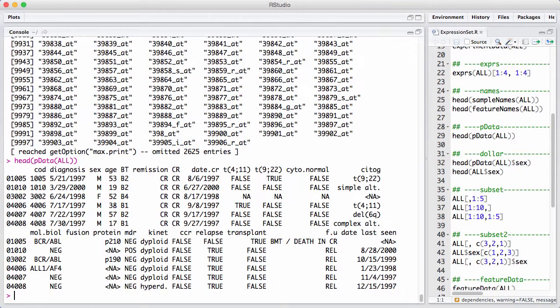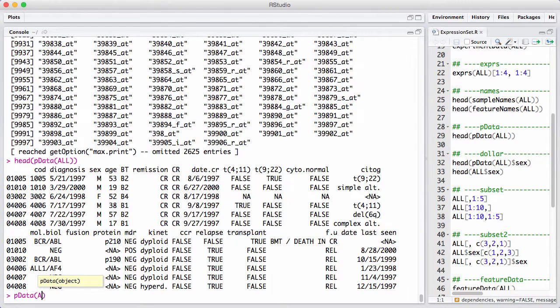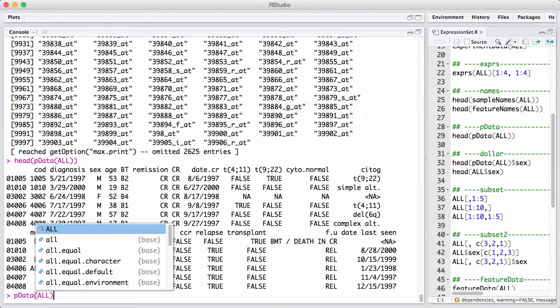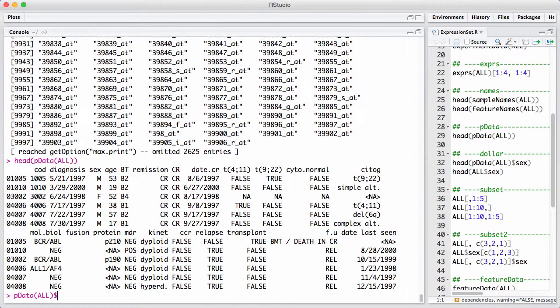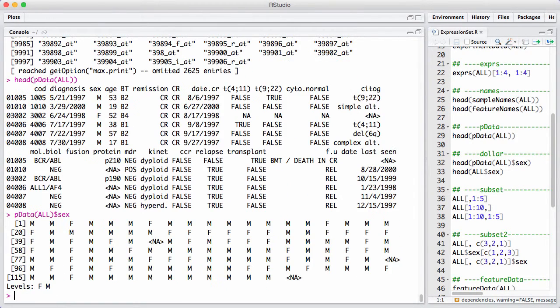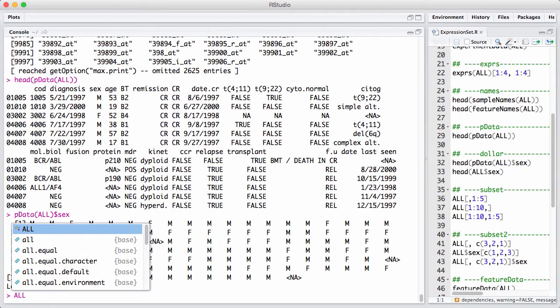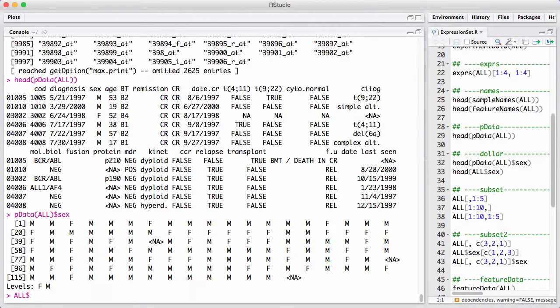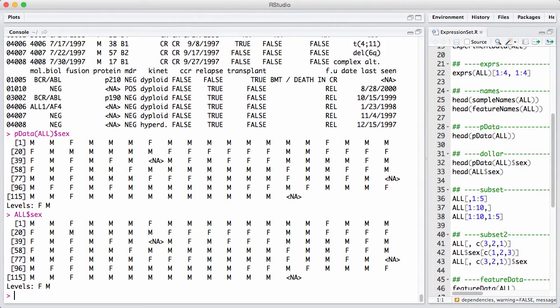Usually you're not interested in all the covariates, but you want to do some modeling or you want to access a specific covariate. You can do that since this is a data frame by using the dollar operator. But you can also just use the dollar operator directly onto the expression set. That gives you the covariate as you can see here. That's a very useful and quick shortcut.